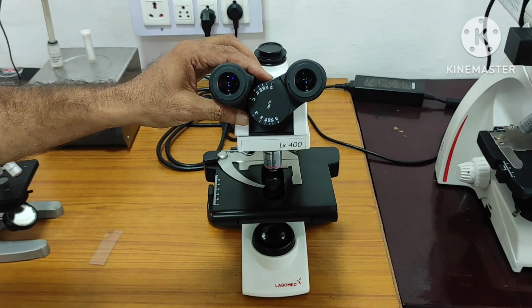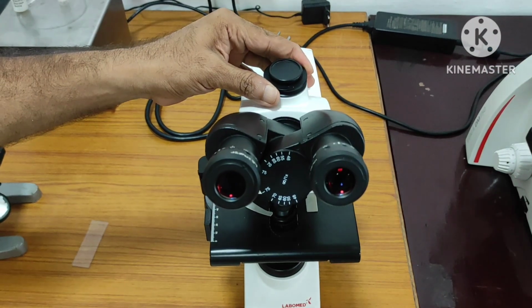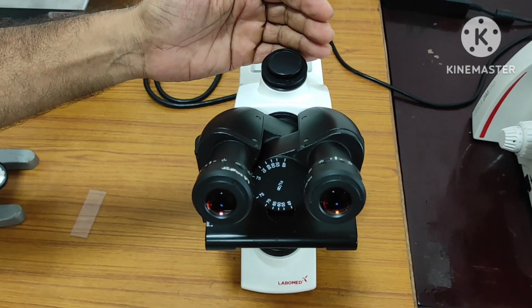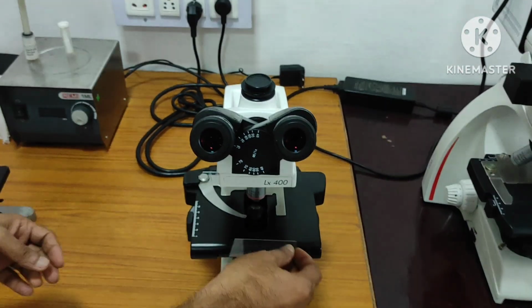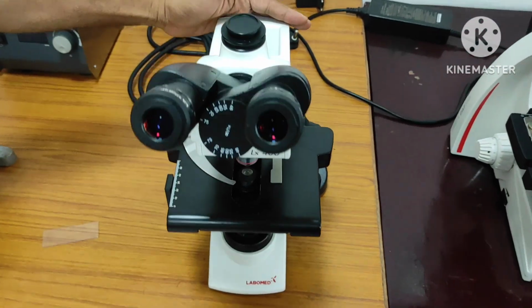It can be a trinocular, another space is provided here, right? This we can open it, and this space is for the fixing of camera. So camera can be fixed here, right? And we can take photographs, whatever the things are present in our specimen. That kind of facility is available here. This is the arm only, right?